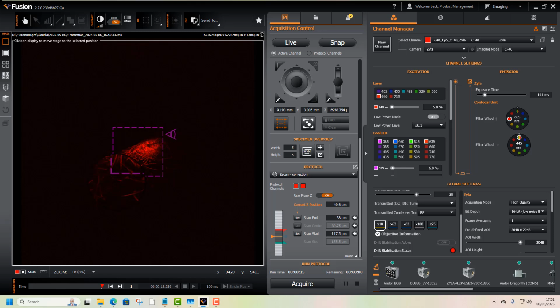So now I will put the head of the microscope back, remove the sample holder gently. The sample must be pressed tight so it doesn't go out of place, and then press to the 63x objective, add oil, and put the sample holder back in.